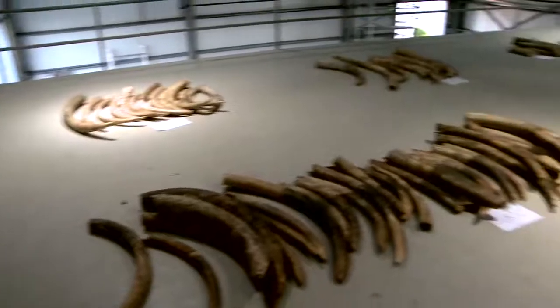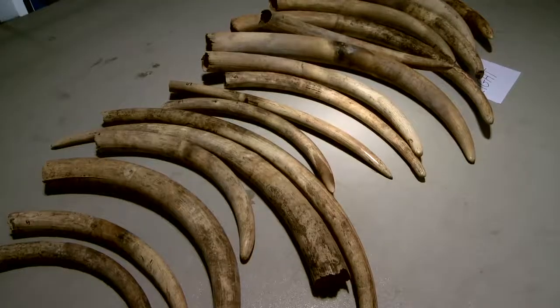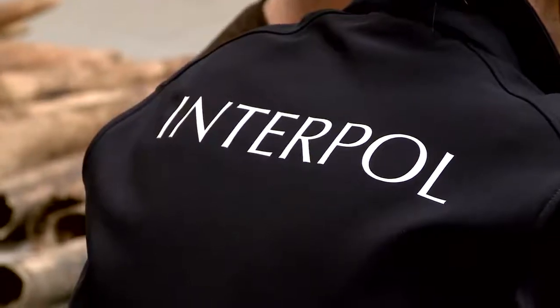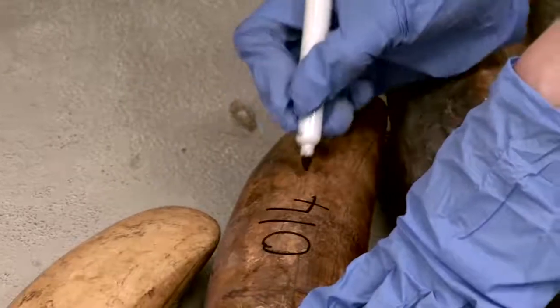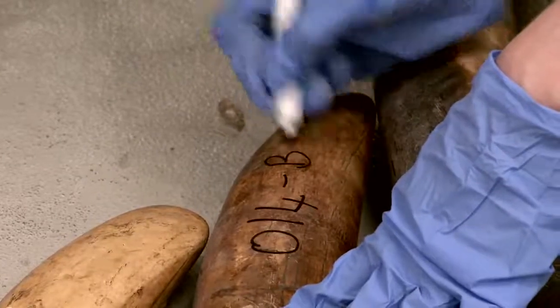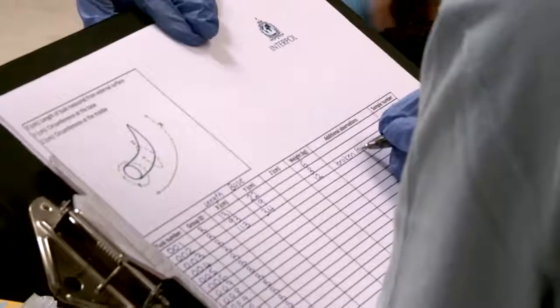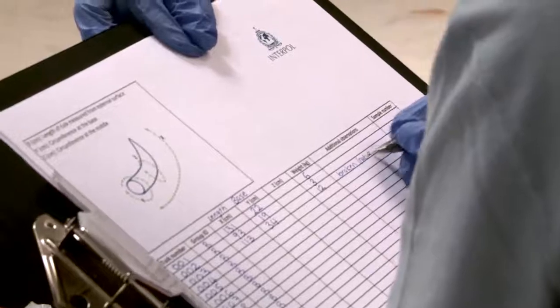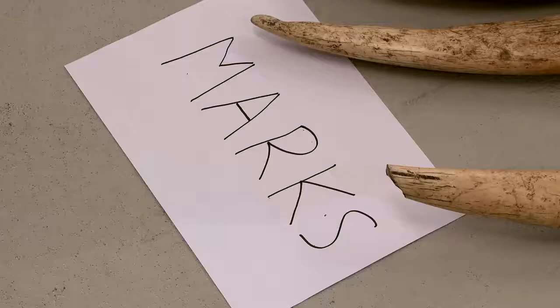This step should only result in a small number of groups. It is possible that no characteristics can be used to group the tusks because all tusks look roughly the same. Give each group a letter and record the identifying characteristics of each group on the datasheet, explaining the characteristics of each group. For example, in Group B, all tusks were burned. In Group M, all tusks had marking in red pen.